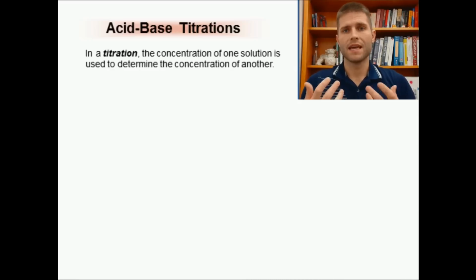However, chemists, like I've said before, are lazy and we tend not to write out what the concentration is on that bottle. So that's a bad thing. We want to know exactly what the concentration is in order to figure out how this chemical is going to react in our different experiments. Another thing that can happen is if chemicals are sitting in a stockroom for an extended period of time, the concentration will actually decrease, or some of the solute will start decomposing and your concentration will change over time.